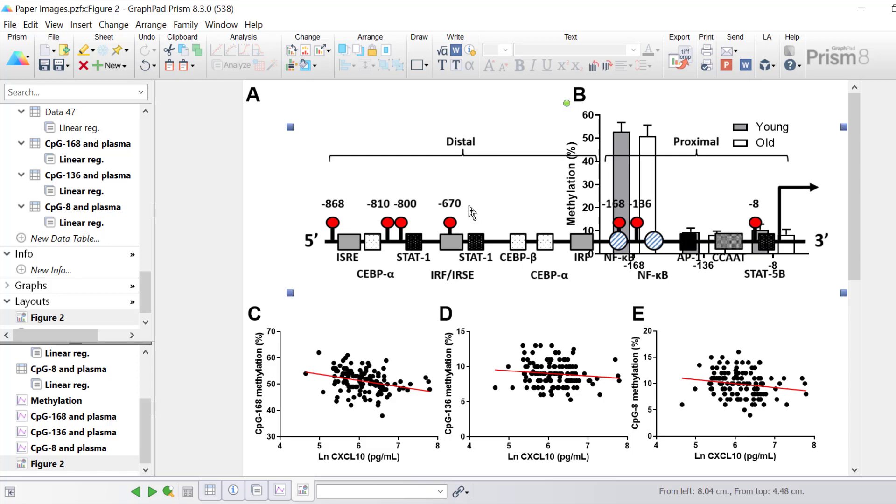Now you can see the schematic has been inserted into the layout page in Prism. If I click on the picture you'll notice that there are four blue squares in each corner of the picture. This is because the picture is classed as an object within Prism.